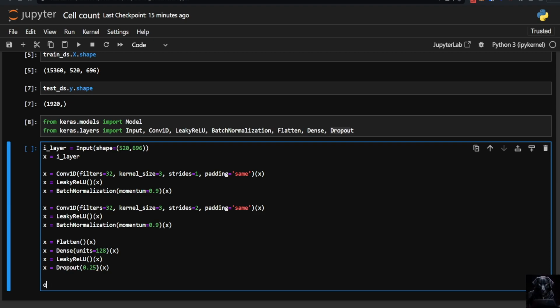And the final one is going to be our output layer. That would be, again, another dense layer. This time the number of units is going to be 1. We just want a simple output, how many colonies it has. Again, it's going to work on the previous layer.